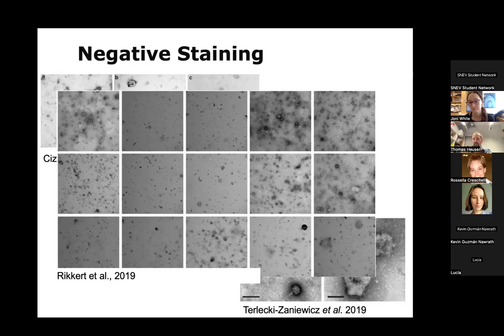And most eukaryotic cells are, of course, much thicker than that. There's another approach, for example, high pressure freezing, that you can use to also freeze entire cells or even small tissue pieces. And what many people will do is use this high pressure freezing to freeze the sample, to get basically a cryopreserved sample.